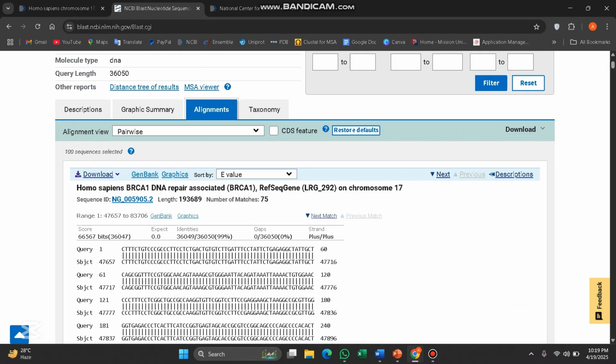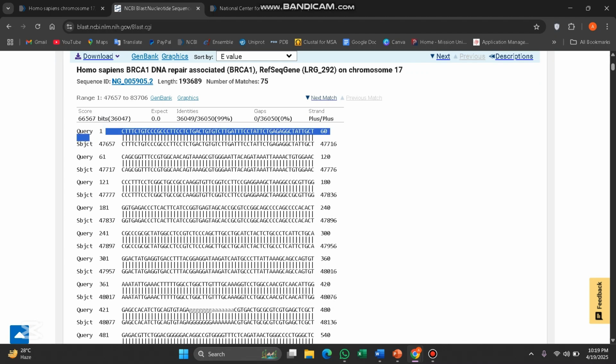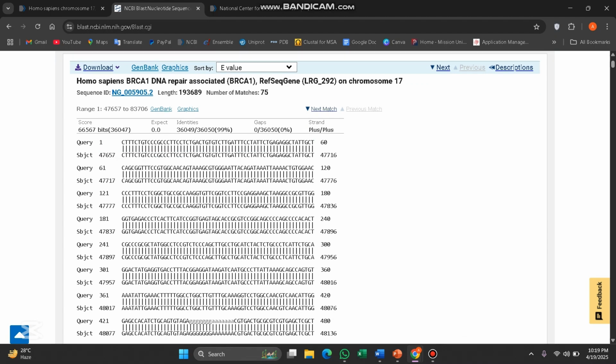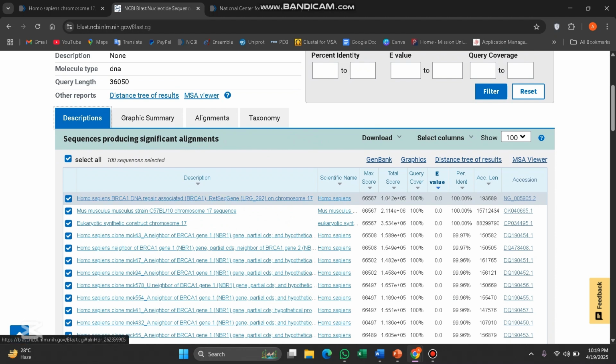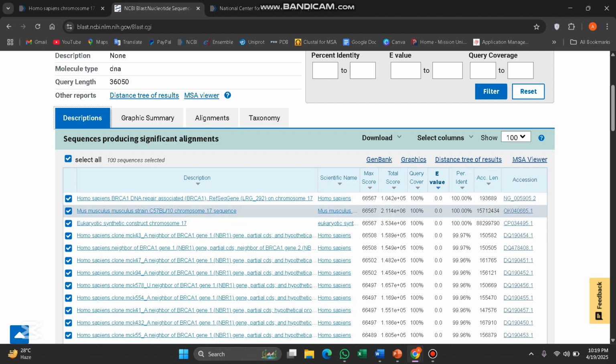In the alignment, we have the query and the subject. It is 100% matched to BRCA, but it is also 100% matched to the Mus musculus strain. So it means that a lot of sequences present in one species are 100% matched to another species. By this, we can relate different species to each other, and doing this is called evolutionary relationships.